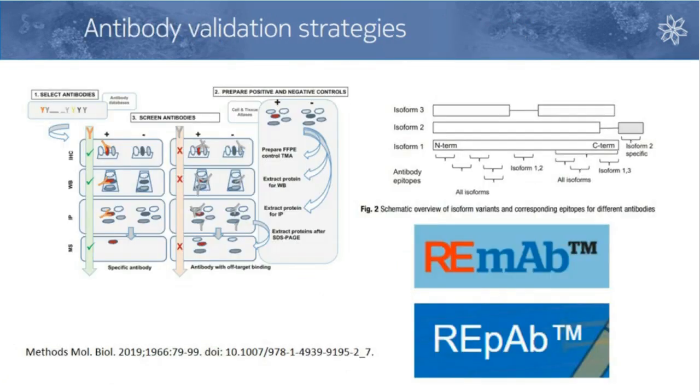Antibody validation could be of keen interest here as well in your therapeutic development pipeline. As I mentioned earlier, you might be building an assay against a target, and you're trying to validate your antibody for specificity, for high affinity and things like this. Let's say you started off with 10 or 15 different commercially available antibodies, and you've been working with those and developing your pipeline, but none of them really worked out all that well as compared to a molecule that you might have in your hands already.